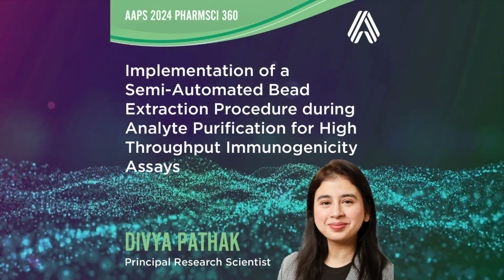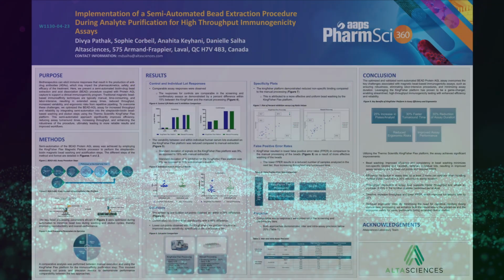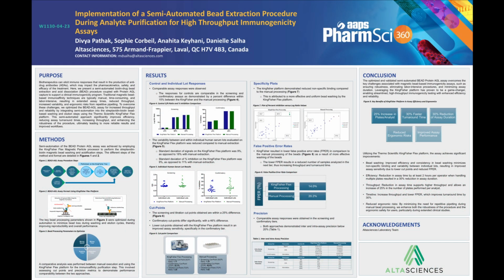And today I'm going to talk about the poster implementation of a semi-automated bead extraction procedure during analyte purification for high throughput immunogenicity assays. To begin with, biotherapeutics can trigger immune responses, leading to the production of anti-drug antibodies, which may affect the drug's pharmacokinetics, safety, and efficacy.